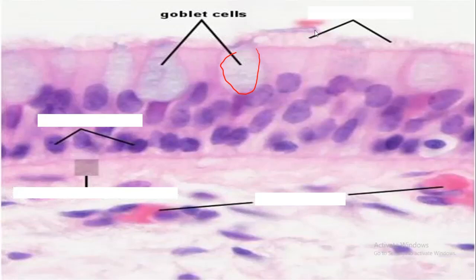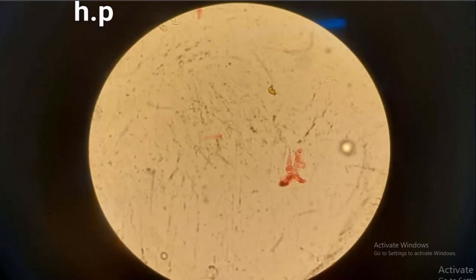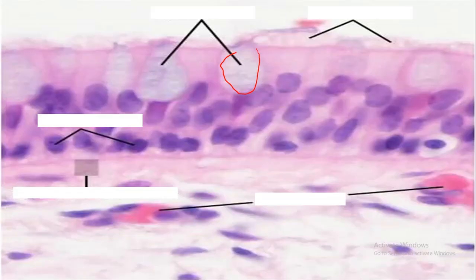This is how we were supposed to view these slides, but you can't appreciate it much unless we use this other slide. In this slide, this is the columnar ciliated epithelium, and one important content you can talk of is the goblet cells. These are goblet cells which have been filled up with mucus, because these cells are unicellular glands.